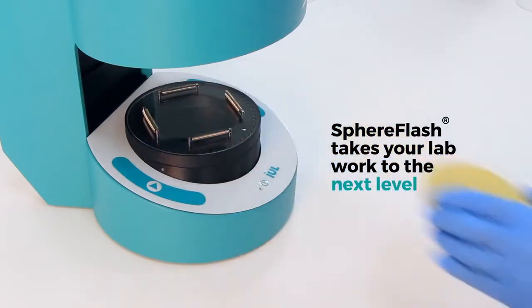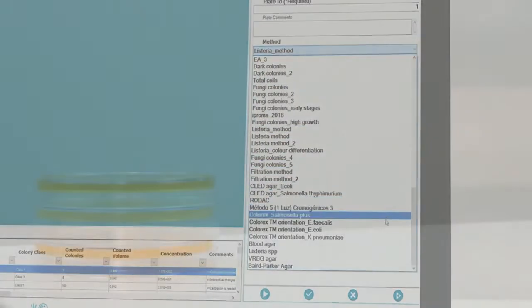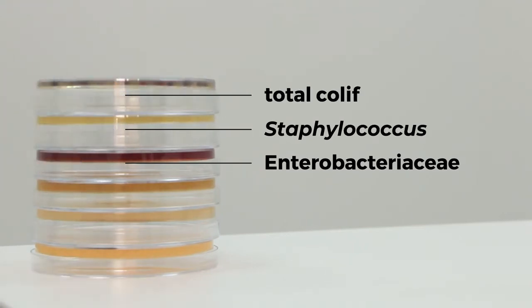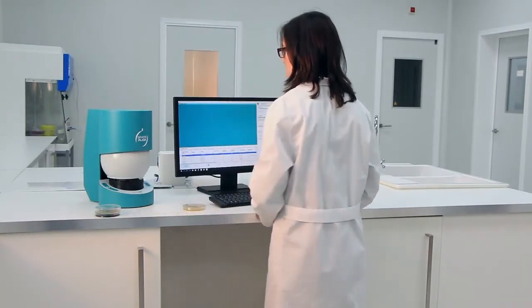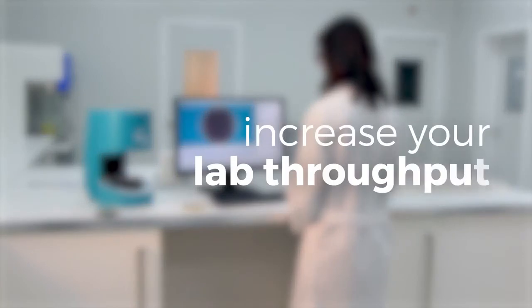The intelligent SphereFlash software automatically programs setup for most plates to be counted and includes several relevant preloaded methods, so that you can get started immediately without time-consuming formatting and input. Image capture and data delivery happens in the blink of an eye, eliminating an important bottleneck to increase your lab throughput.